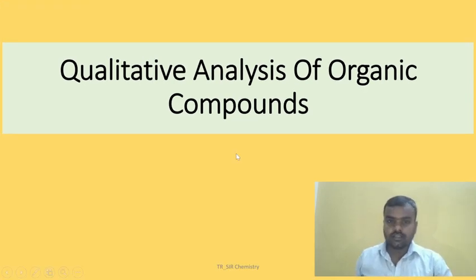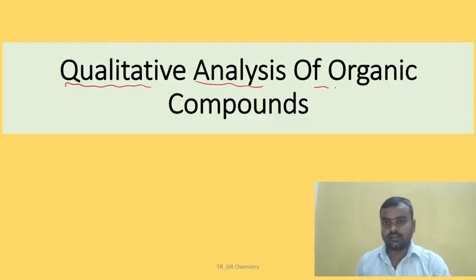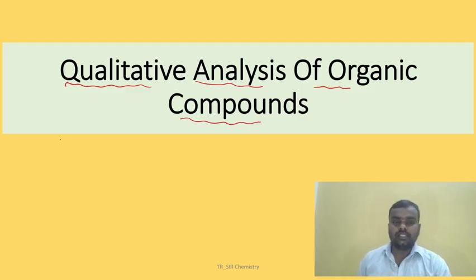Hello students. So today we'll discuss qualitative analysis of organic compounds. What exactly do we mean by this particular word? In general, organic compounds available in the earth's crust might have some other elements also.